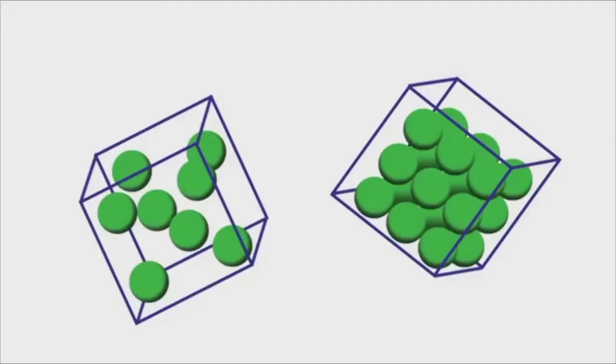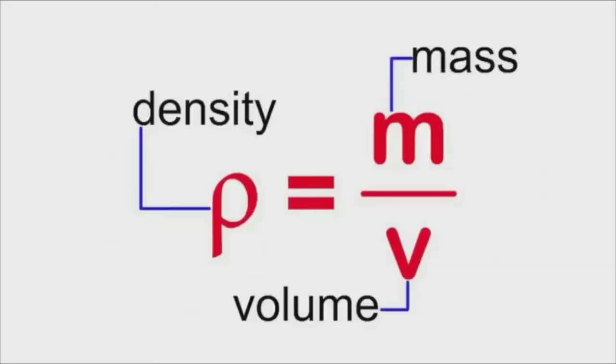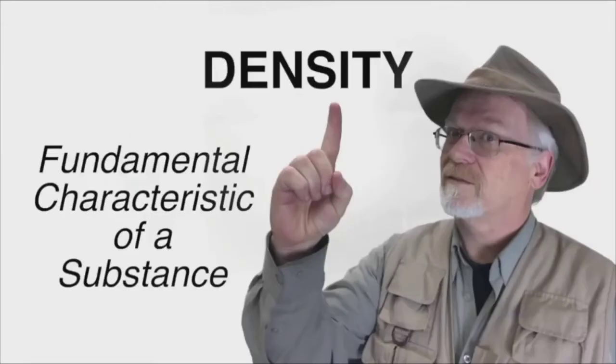Now I would like to present my exam with the title Weight of Liquid and Solids with Pycnometer. Basically, the determination of the level of dry substance or brix can be done using the principle of density and specific gravity.